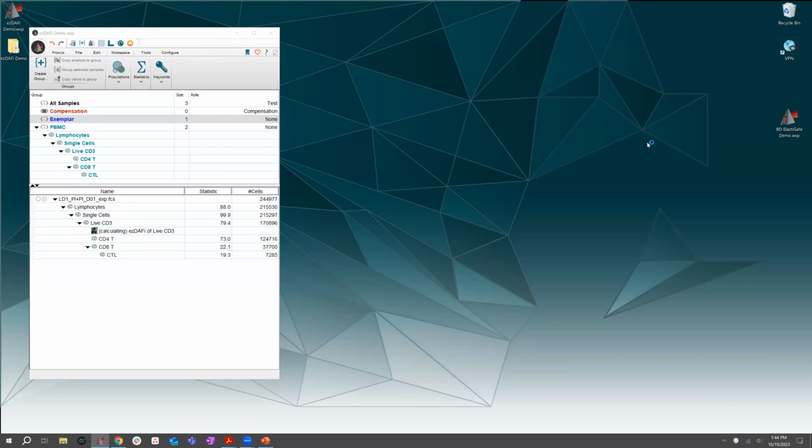But yeah, I think it's marginal, right? So, with any of our tools, the more parameters you have, the more cells you have, the more files you have, then yeah, some plugins will take longer. But I think you'll only really notice a difference if you have really massively different files, right? So if you're running the tool on a panel that has 3 colors versus a panel that has 40 colors, I think there you'd notice a difference, but maybe a difference from like 10 to 20, you probably wouldn't notice that.